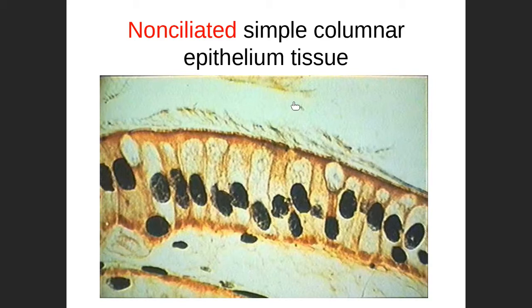And then we also have the cilia, which is a hair-like appendage, and then the flagella or flagellum, which is like a tail that's attached to the cell, and it's for mobility and movement of the cell itself, whereas the cilia will move back and forth, and the cell will remain stationary, but the cilia will move things past the cell.